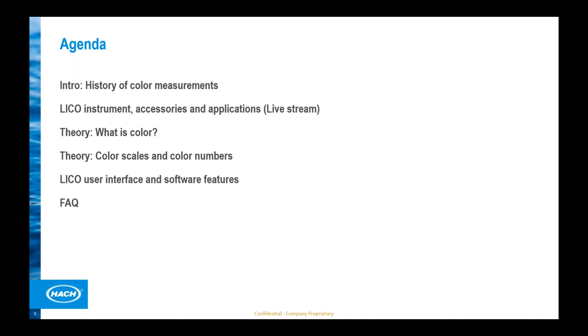instrument itself. Then we will continue our webinar with some very important background information to understand much better how the LICO is working and what the background of color measurement is in theory, color scales and color numbers. This will be held by my colleague Juergen Moeller-Kemsa. And then at the end of our webinar, we will also have a look at the interface, software features, etc. And there's also time for some FAQs at the end.